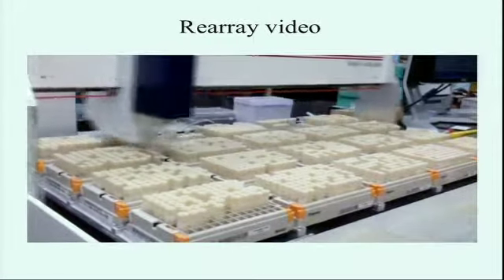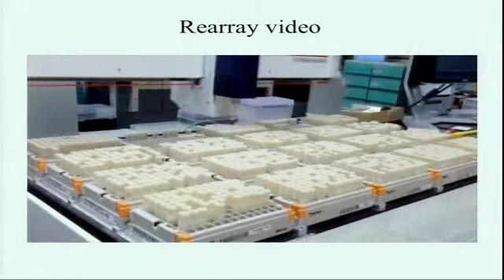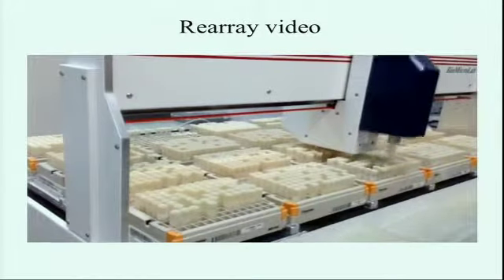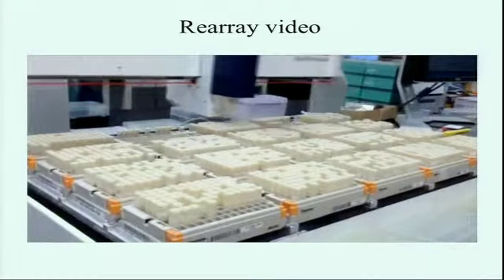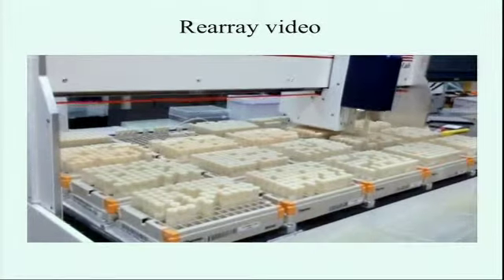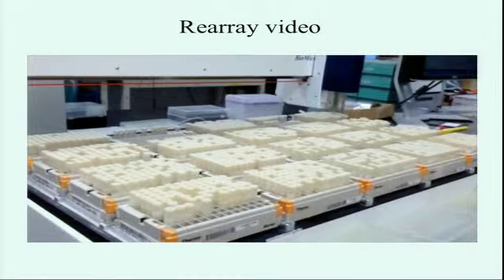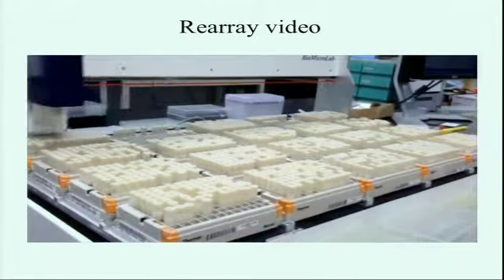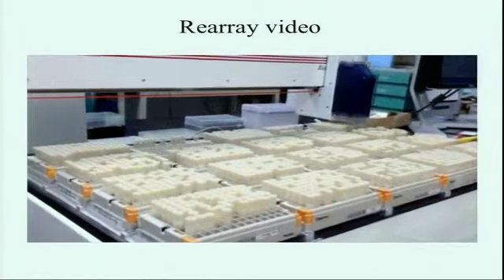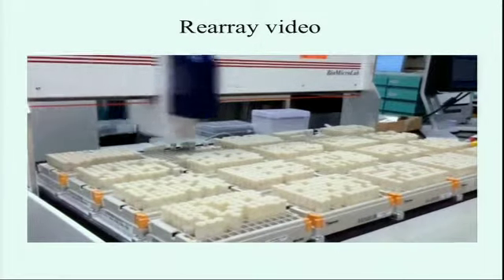This cuts down on a lot of time spent in the lab, since with this program you can join multiple rearray files at once, so you can run more than one file at a time. Also, you can see that not everything in the source racks is being used, so this helps minimize the time that bacterial glycerol stocks thaw on the bench. There's not a lot of time spent sitting out. Once everything is cherry picked, they can go back into the freezer as quickly as possible.